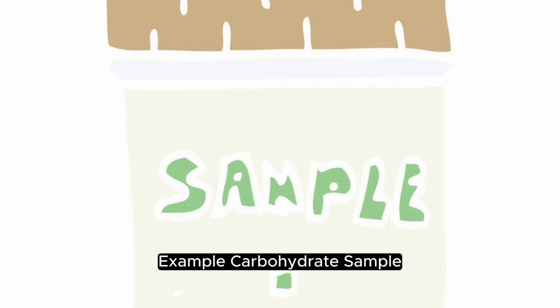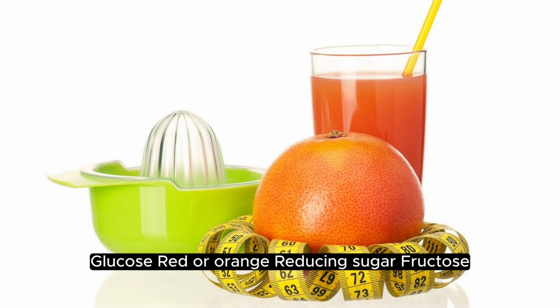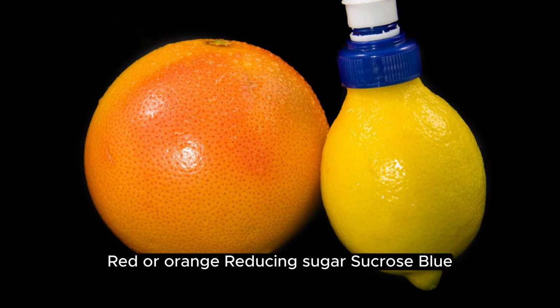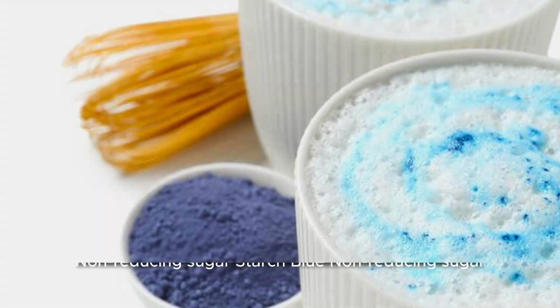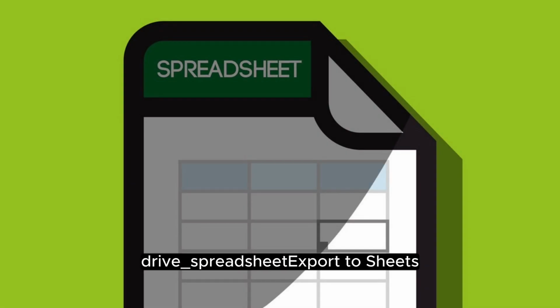Example: carbohydrate sample, Benedict's solution or Fehling solution, result. Glucose, red or orange, reducing sugar. Fructose, red or orange, reducing sugar. Sucrose, blue, non-reducing sugar. Starch, blue, non-reducing sugar. Cellulose, blue, non-reducing sugar.